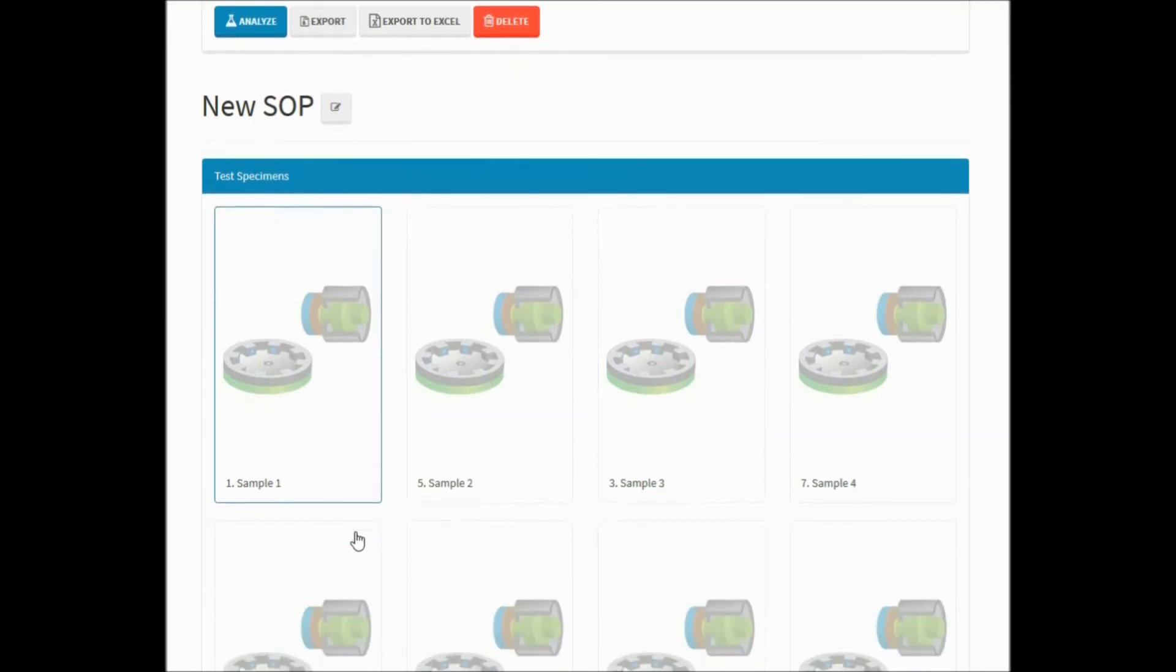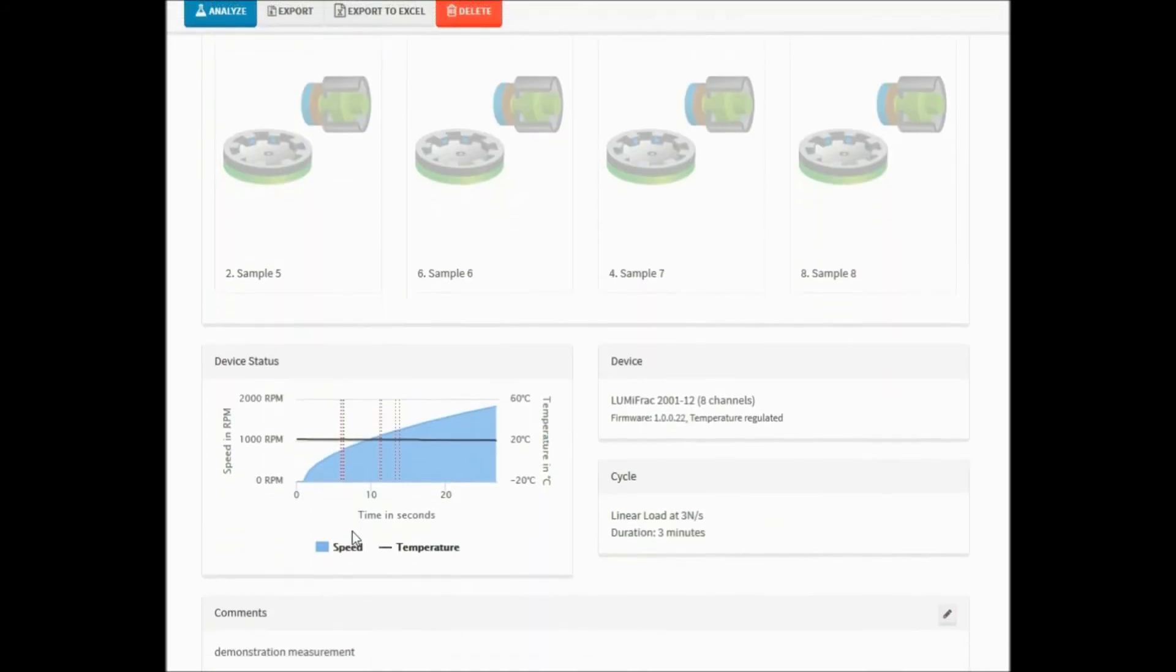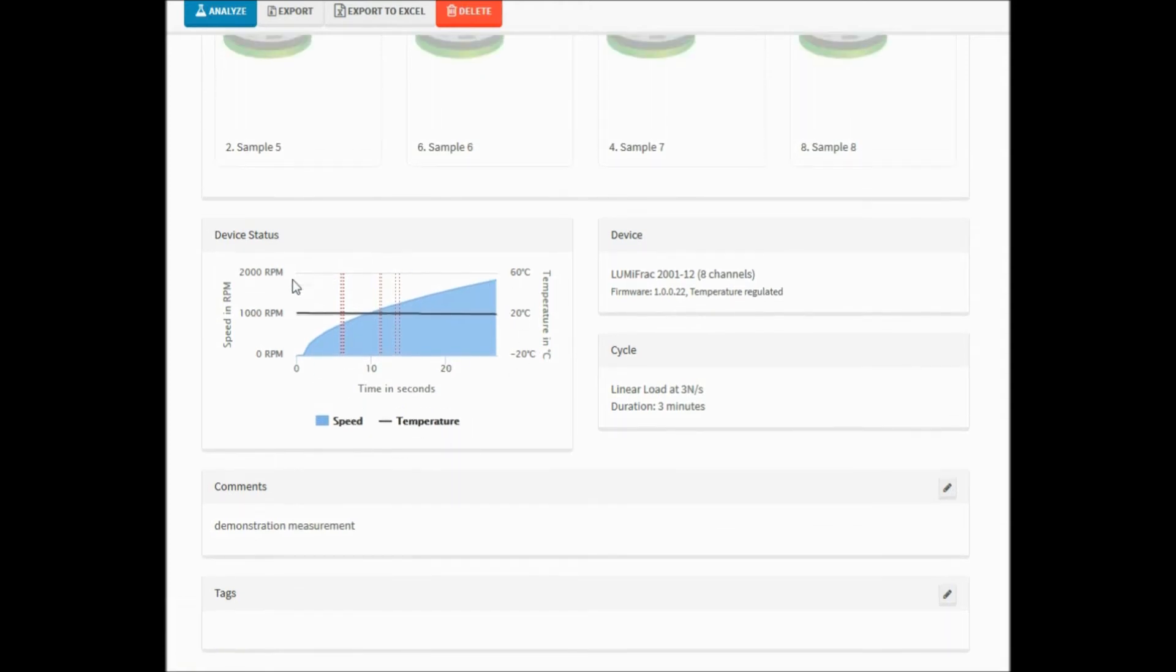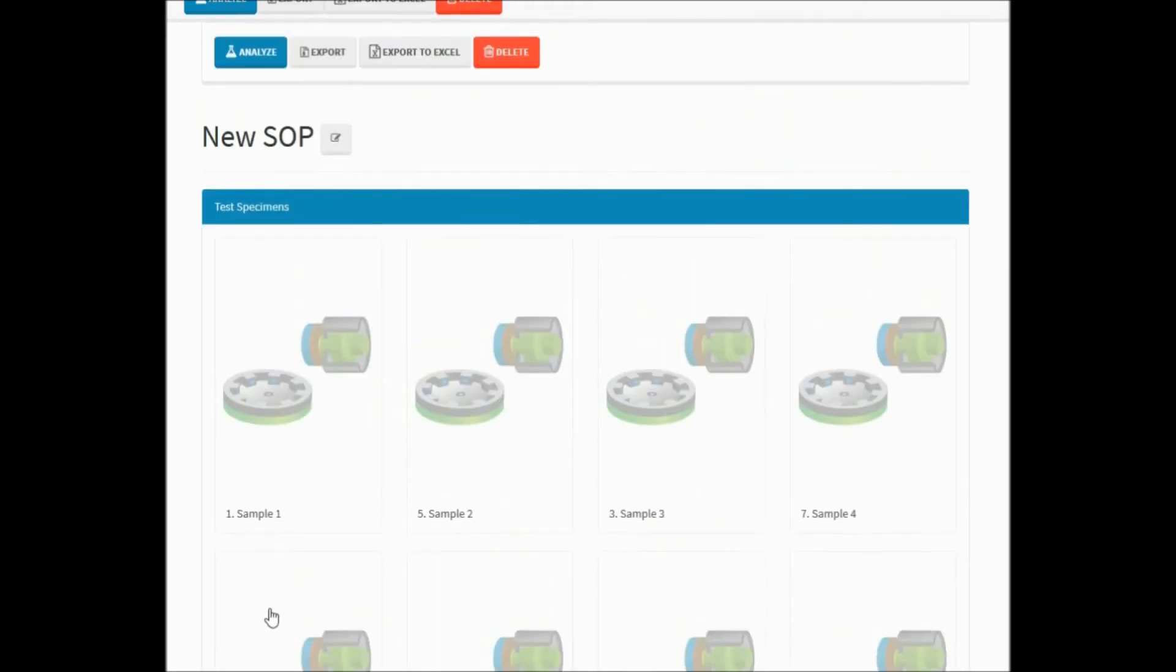Here you see a detailed display of all your measurement details. Samples can be individually specified by uploading fracture images and by adding additional information, for example, used adhesive, coating, substrate material or comments regarding the fracture behavior. The device status, the speed and temperature settings, the duration, all are saved here for a convenient evaluation. You can also tag with keywords that can be easily searched and found later in your database.